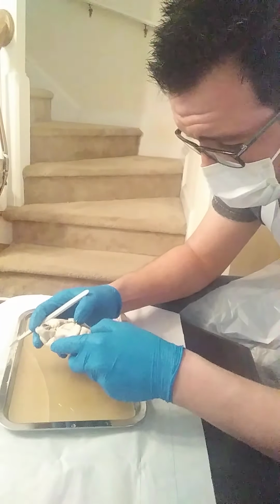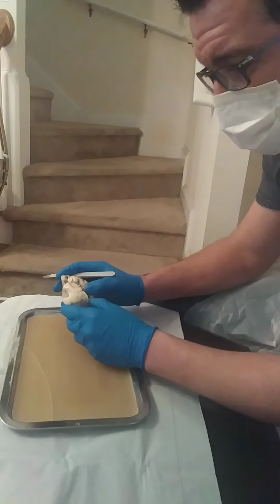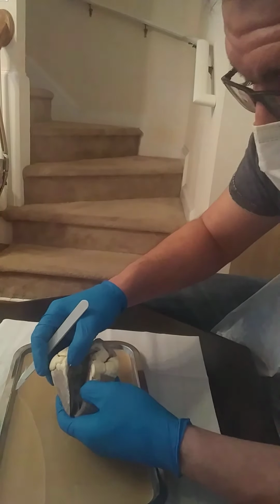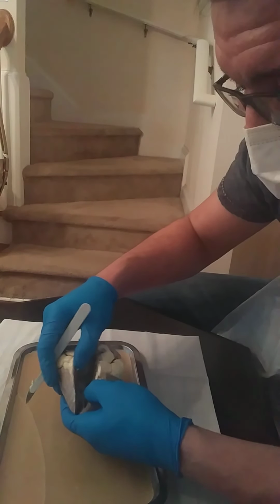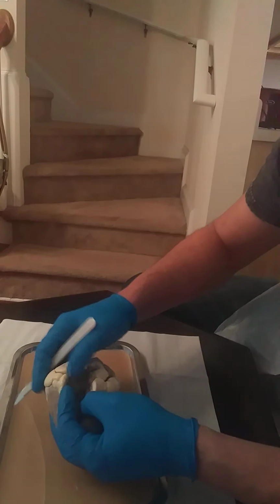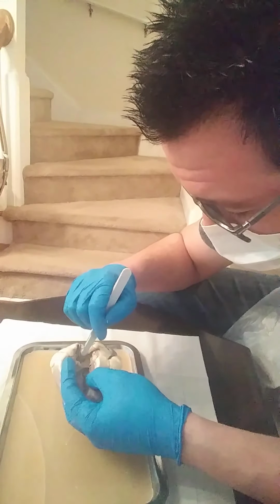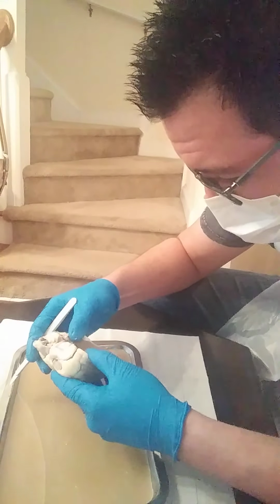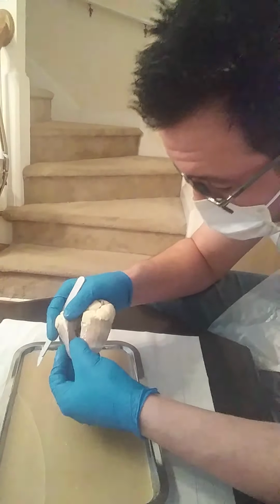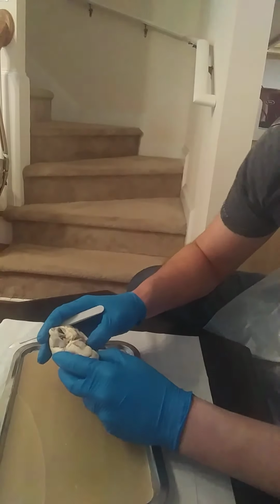There we go. So, I don't know if you can see quite well or not. I'm inside the heart. This side would be the right ventricle, and in there would be the tricuspid valve. And inside it would be the papillary muscles, which I assume would be this right here. There's the tricuspid valve. On the left side, this would be the epicardium, the outside portion of the heart. Part in the middle would be the myocardium, and then the inner portion would be the endocardium. Alright.